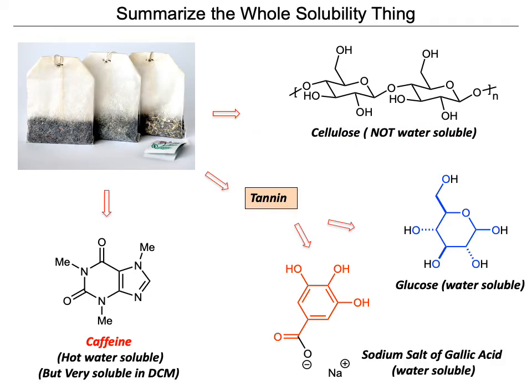To give a brief summary of what we want to do in this experiment, first of all, we are going to brew the tea inside a beaker, and after having the tea, we are going to use the DCM to extract caffeine from the water phase. As we know, caffeine has a moderately polar structure, and DCM is also moderately polar. Both moderately polar substances attract each other better.